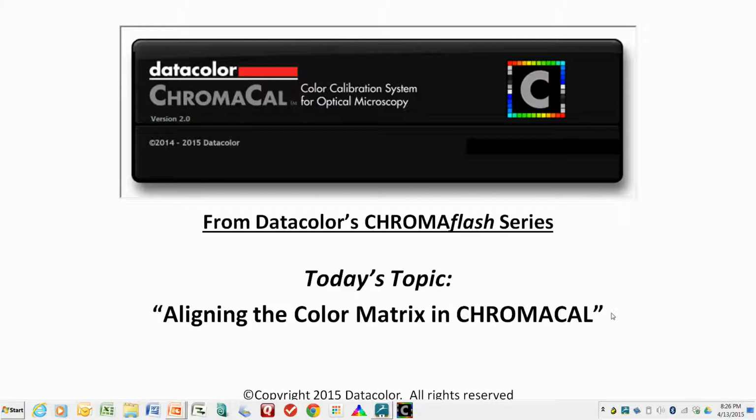Today's segment is a tutorial on aligning the color matrix in the CHROMACAL image software.